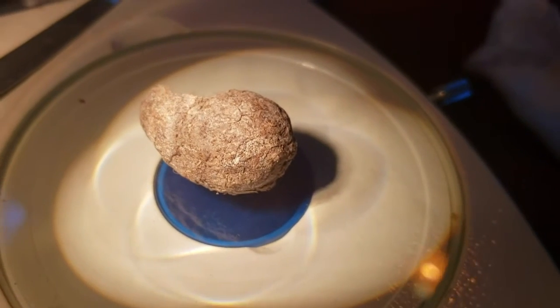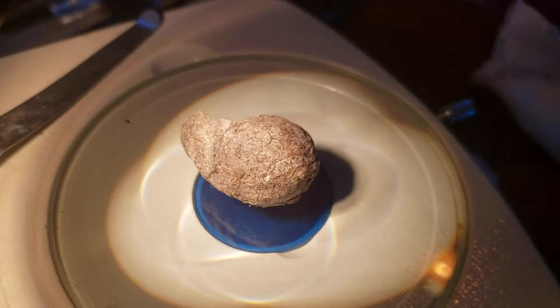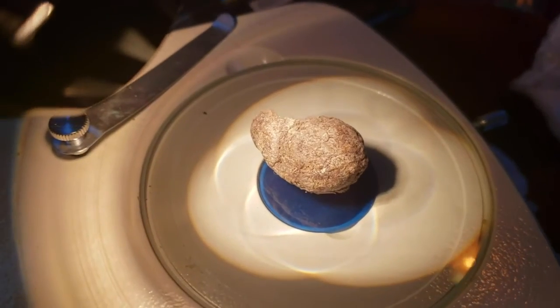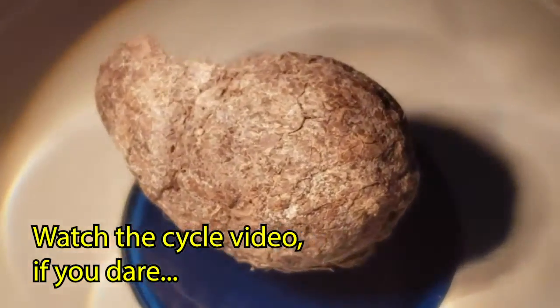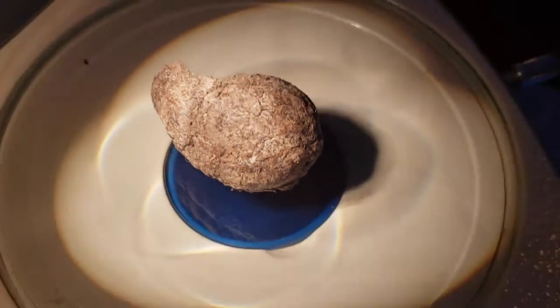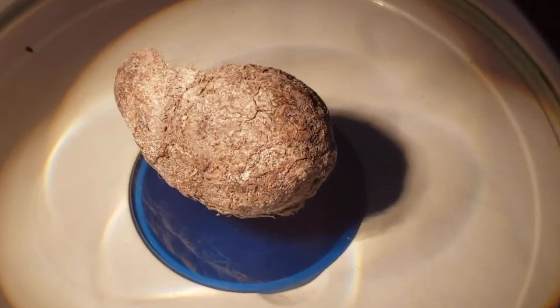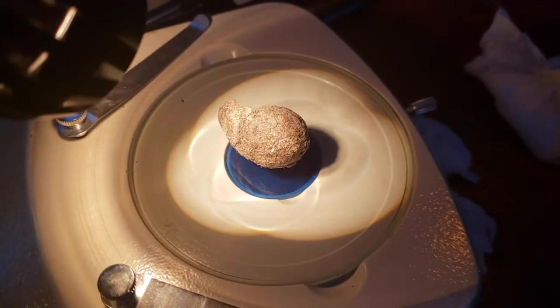Hey kids, what we have here is one of the owl pellets that I collected beside my tent site in that farmer's field near Año Nuevo, California. What we're going to do today is break this thing open, find out what is inside of it, and see what we can learn about what the owl, probably Bubo virginianus, the great horned owl, eats, when it eats it, and so on.